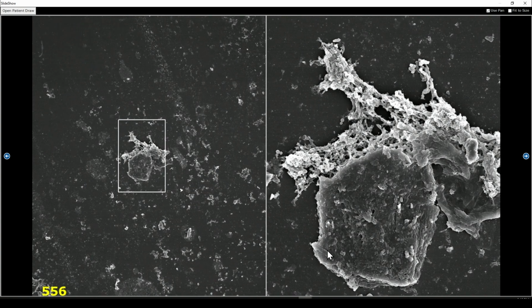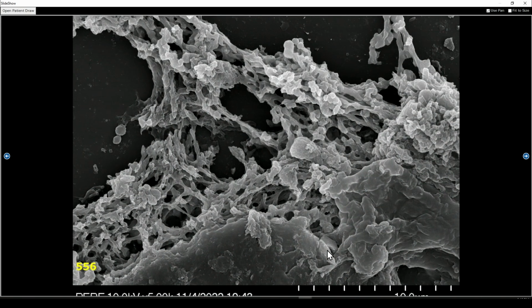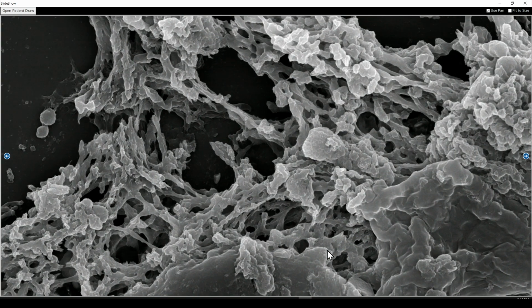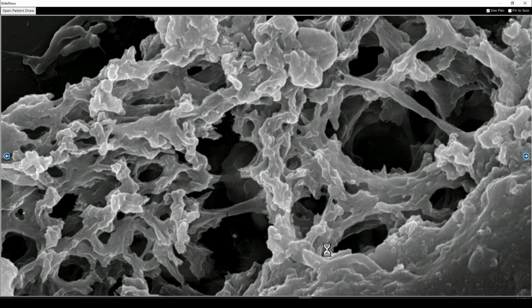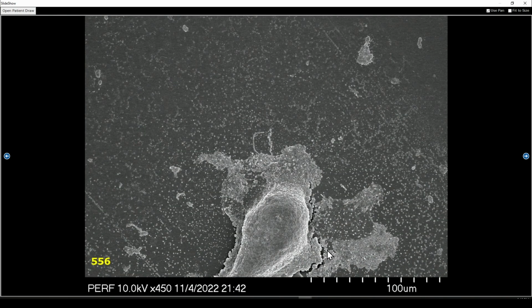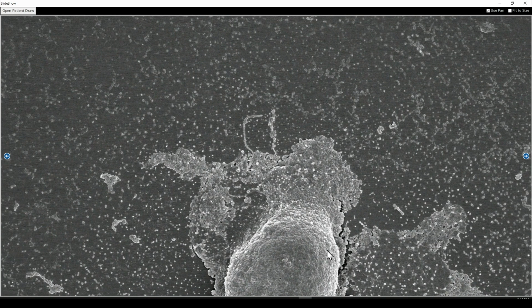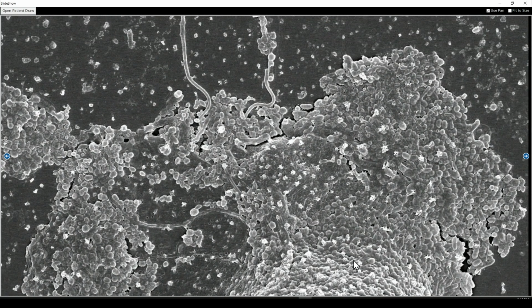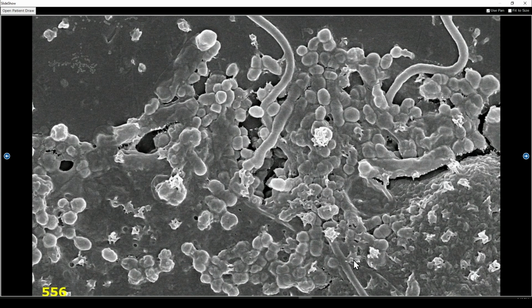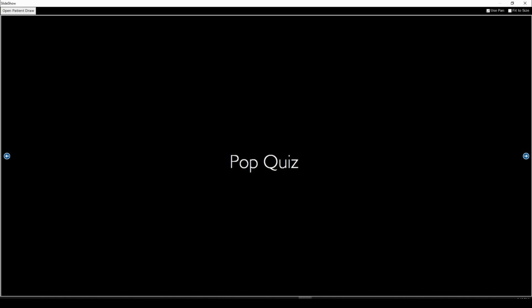And when you look at them under the SEM, you can see this detachment taking place from the body of the biofilm. And remember, these are dehydrated, so in a hydrated specimen, you can imagine how complex this architecture actually is. And here you can see a glycocalyx, but if you look carefully, you can also see there's detachment also taking place. So that's what you really want to look at when you're looking at endodontic specimens.